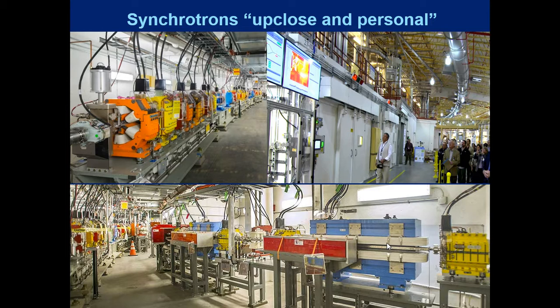Now, this is very powerful energy, and so this particular portion of the ring is behind walls that are made of concrete and lead. And at the top right here, this is one of the beamlines. These are lead doors.